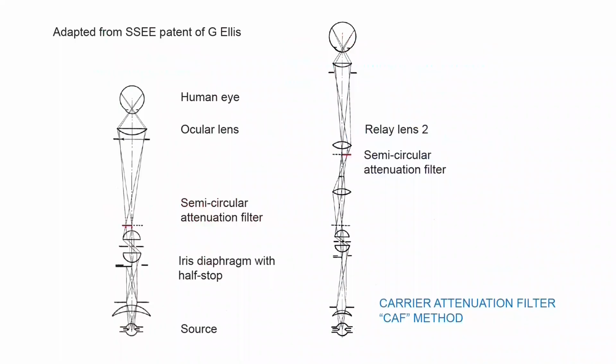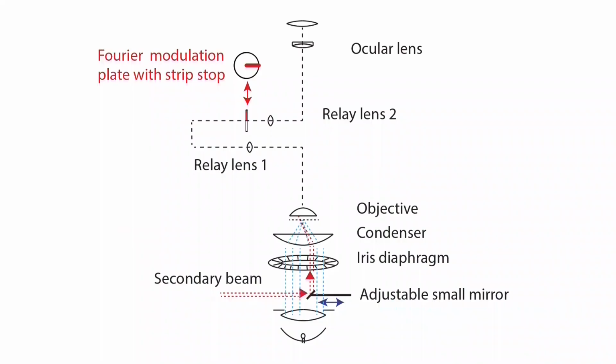Next, we can see some schematics for single sideband microscopes. The right panel shows a 4F relay to project the Fourier plane to an easily accessible external location. The next diagram shows a folded version of a 4F conjugate relay.